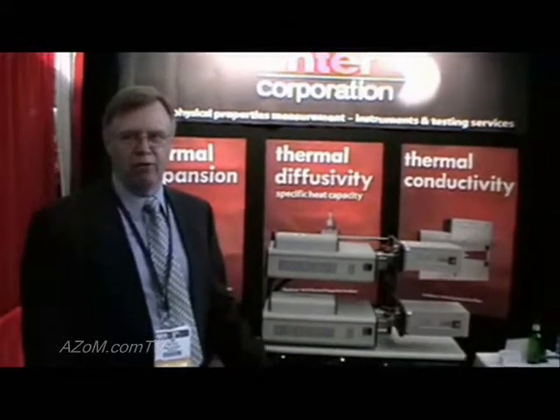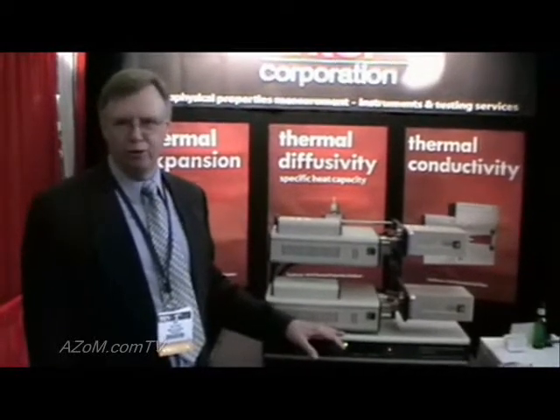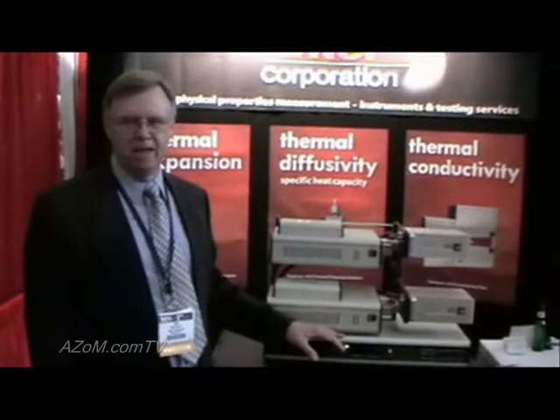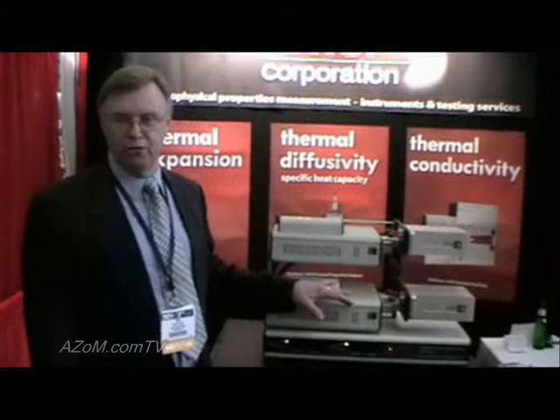This device is used for measuring the thermal expansion of a wide range of materials. This particular model is a multiple sample model where we can actually measure up to four different samples simultaneously. It has a variety of different furnace types that we use for different materials.